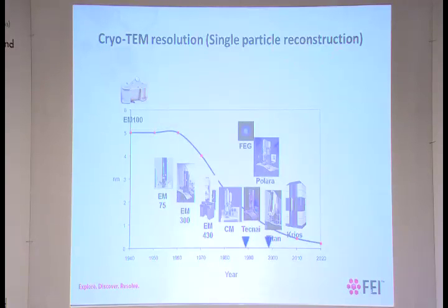The other thing was the software. So now our software is very versatile and robust. So we can really control the lenses and the deflectors of the machine very precisely, so we can manipulate the beam well without any latent thermal drifts.